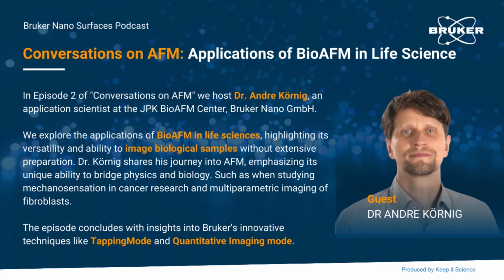I mean, there was even one crazy scientist that wanted to put a whole arm below an AFM. So I think it didn't work out completely because the arm is just moving too much for the sensitivity of the AFM. But in general, you can put anything below it and start measuring. I mean, this is what you also said, that it's kind of easy to start using it, because you just have this little cantilever that touches things. So the little finger, just in a very small size. And this is, I think, what makes it so interesting to use in the biological world.